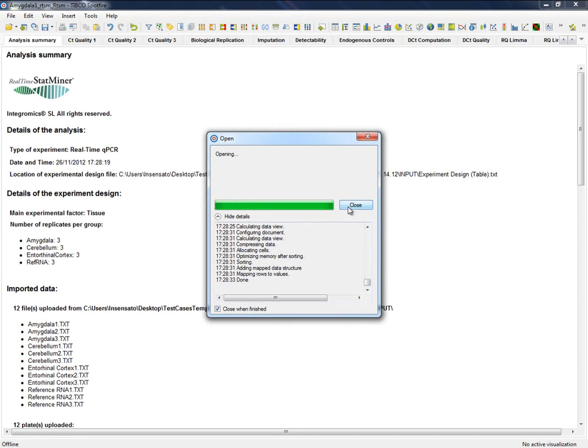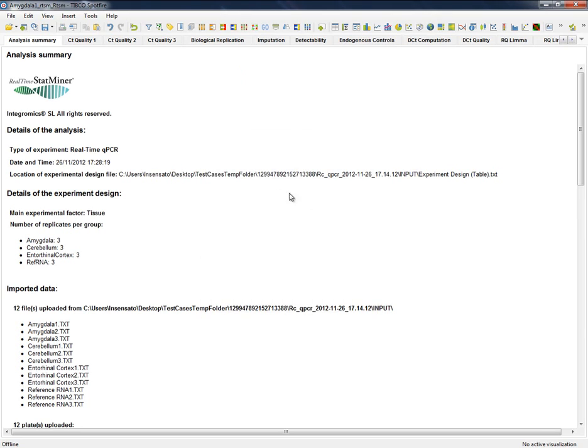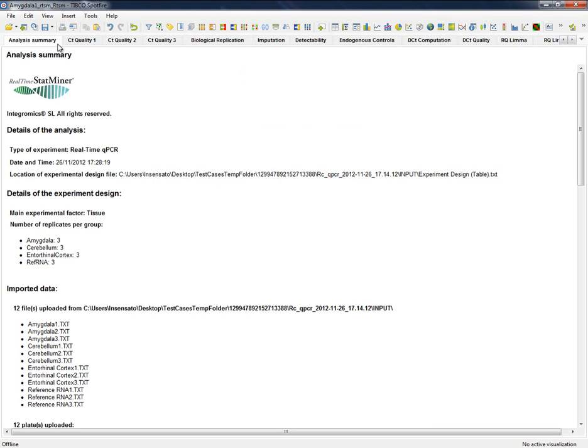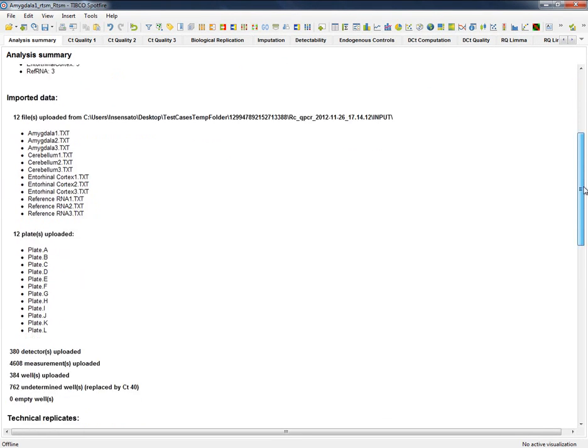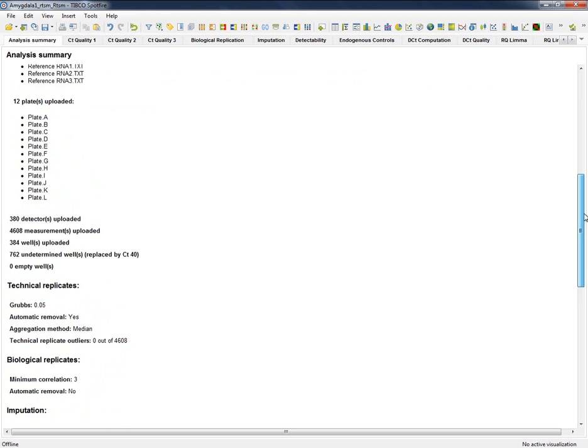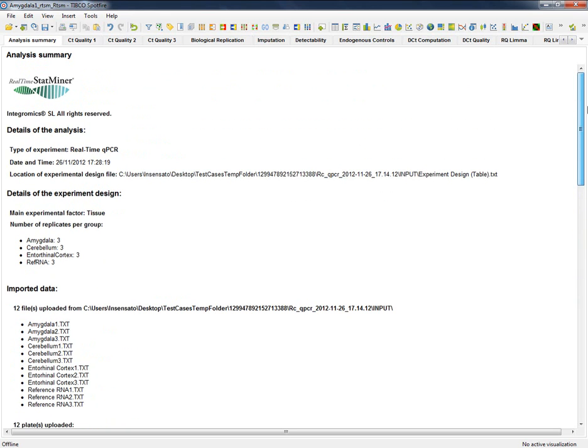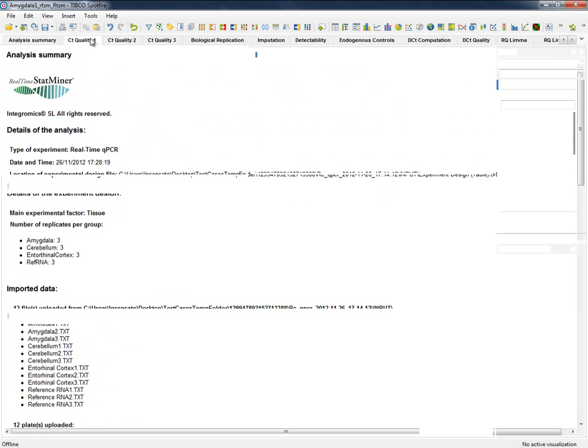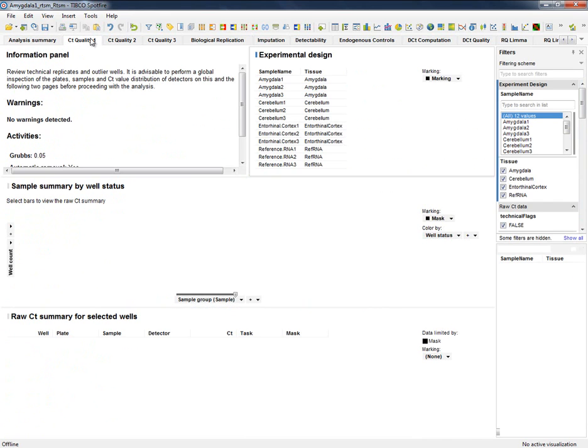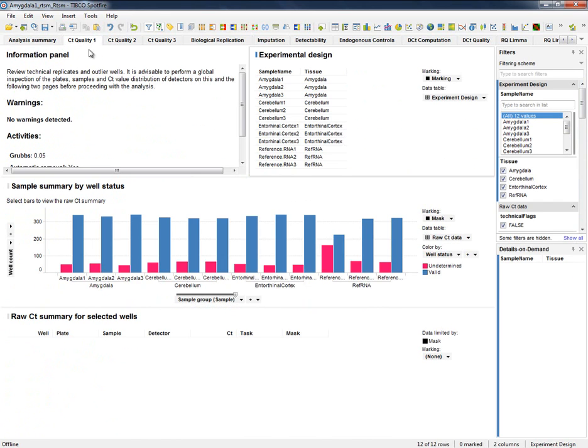These reports can be classified into three main types. Firstly, a summary of the analysis with a whole overview of the sample and quality settings that can be presented for the analysis.